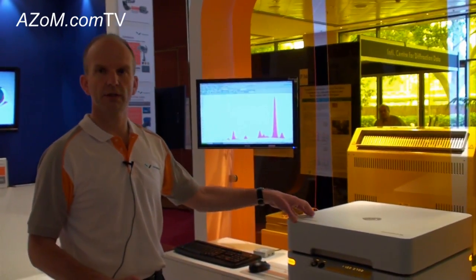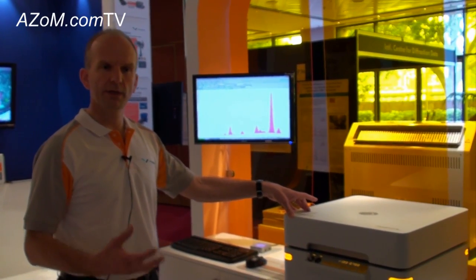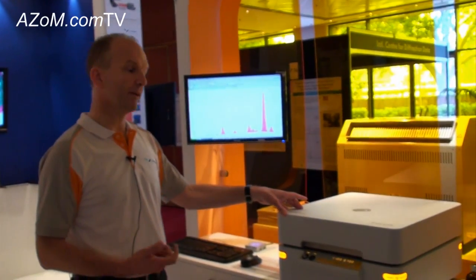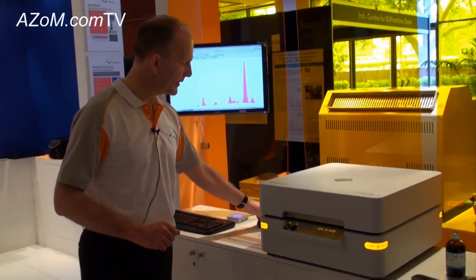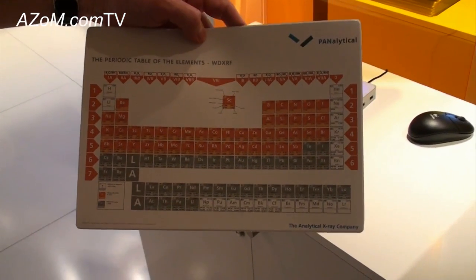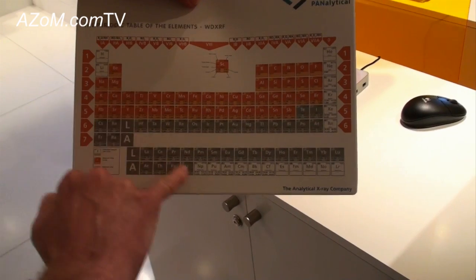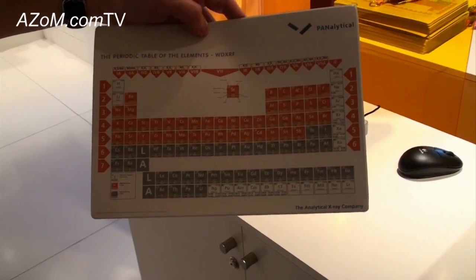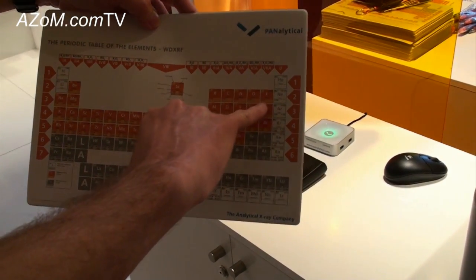It's quite an efficient, rather effective way of analysis, particularly when you only have a few samples per day. Regarding light elements — that's one of the strengths of this system. If we see the periodic table here, traditionally benchtop systems like this would normally cover the range from sodium through the periodic table to uranium. But because of the sensitivity of this system, we can actually analyze this much lighter element: fluorine.